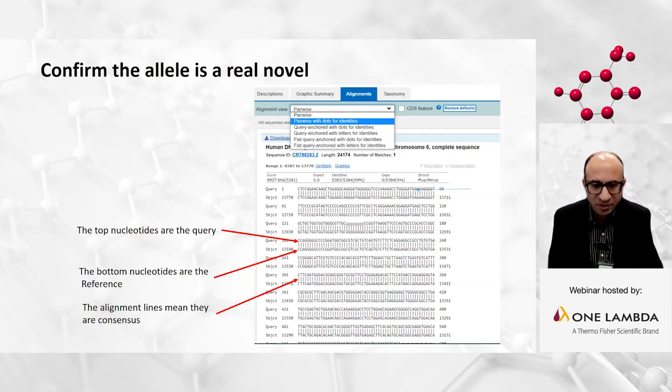But actually, I found that when you're looking at 11,000 base pairs and you scroll, your eye becomes blind and you wouldn't see if a line is missing. So I found an easy way to get around this. Let's see how we can do it.